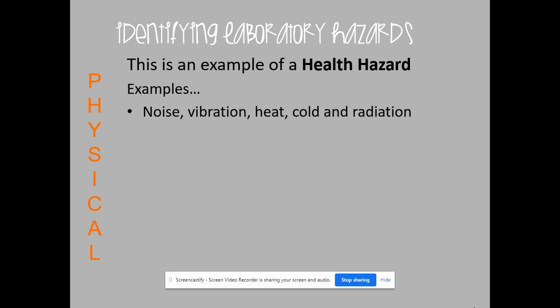Next one is physical hazards. This is things like noise, vibrations, heat, cold, radiation. How can we reduce the risk? Let's isolate that hazard if we can.